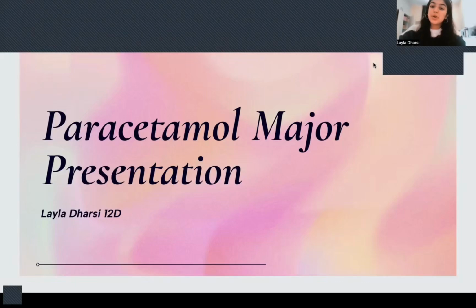So today I'm going to be talking about paracetamol, its synthesis, and a method to purity test it. So to begin with, what is paracetamol?